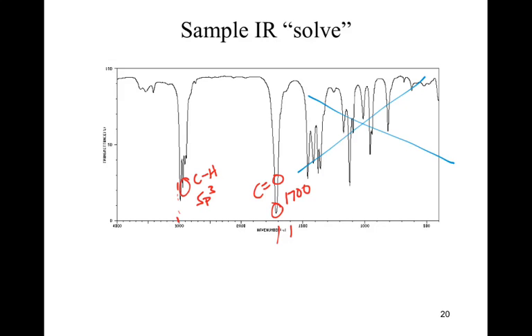I won't evaluate. Here's where we're going to run into a big old hiccup, particularly as you practice these more. This peak, definitely not an OH, vaguely looks reminiscent of an NH. The reason why it's vaguely and not really an NH, if you go back and look at the NH rules, NH says 1 peak or 2 peaks. If you look at that spectra really carefully, there are 3 peaks there. That is not an NH.